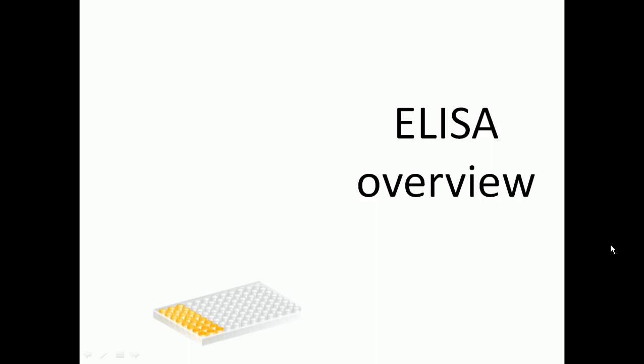Okay. So if we see here, it's an assay, a technique that's called ELISA assay or ELISA technique, whatever you say. It contains a particular type of glassware set like this one, as you can see here. This is called the microtiter plate. This microtiter plate is nothing but a plate containing small wells, as you can see here. There are different types of microtiter plates available. Some of them contain 96 wells, some of them even more wells. Usually they contain 96 wells. So 96 small wells are present all around this.